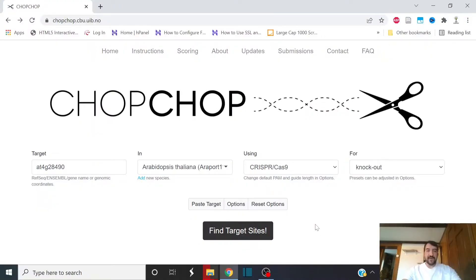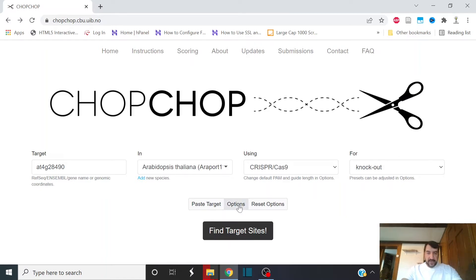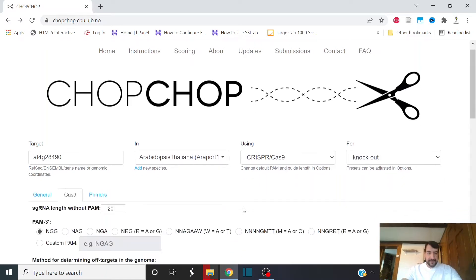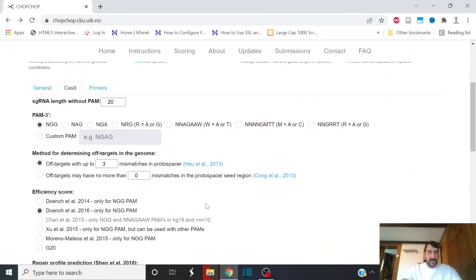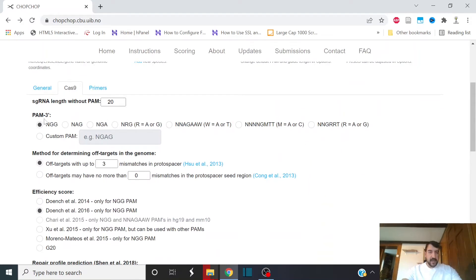I'm going to show you this software here. ChopChop is a great tool for finding gRNAs that are both specific and efficient at cutting their target. It has a lot of options. You can click this. Here we're on the Nuclease tab. You can select the PAM for your given nuclease. By default it's for SpCas9 NGG.